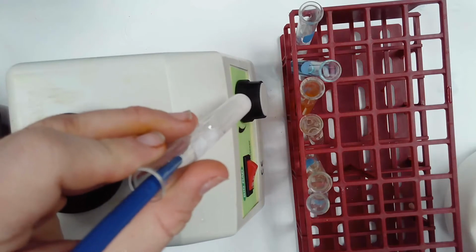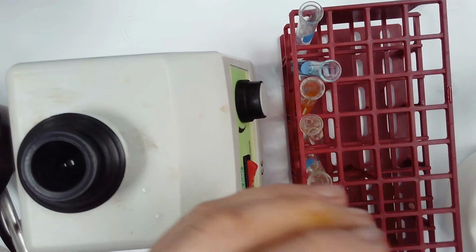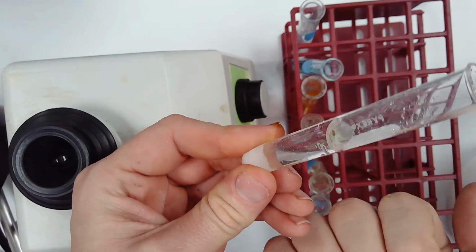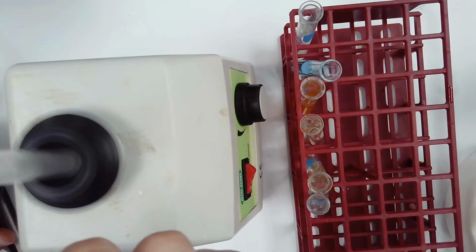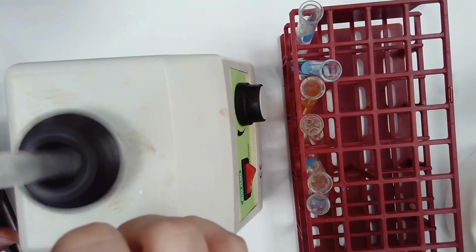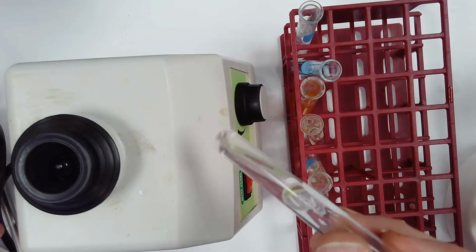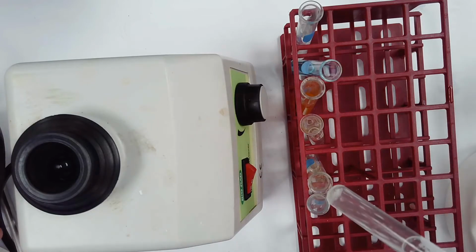Hey, when I feel this one here, it's the opposite of hot. It's actually really cold. So if a reaction gets cold, then what would it be called? I also want to point out how much easier that was to dissolve than the phosphate. It makes some sense when you're all said and done.